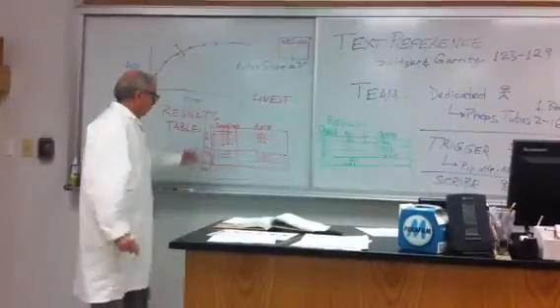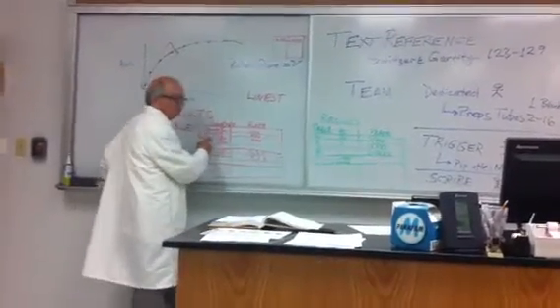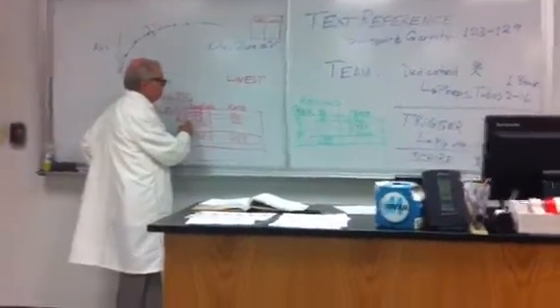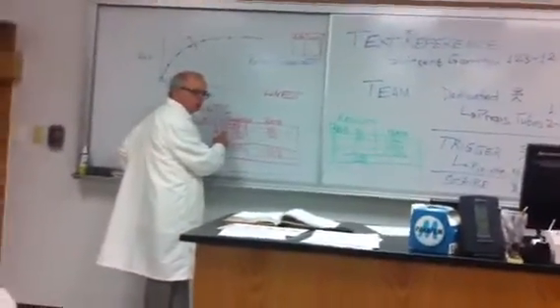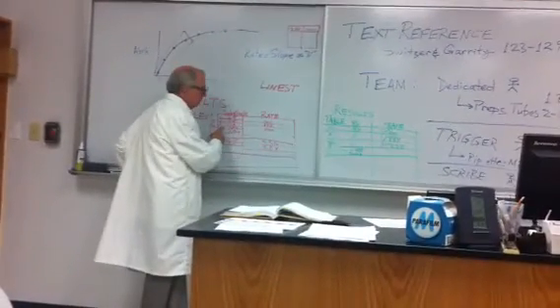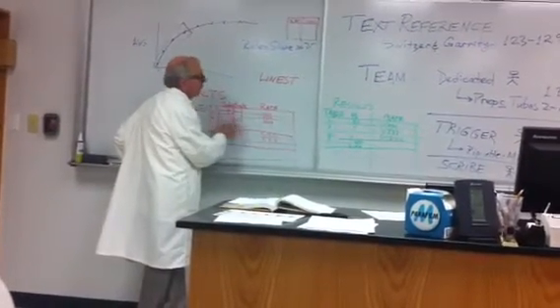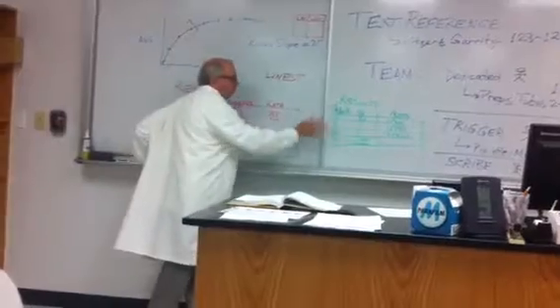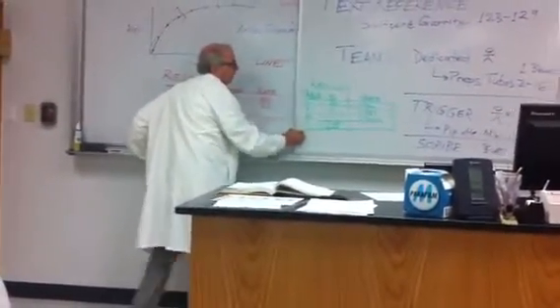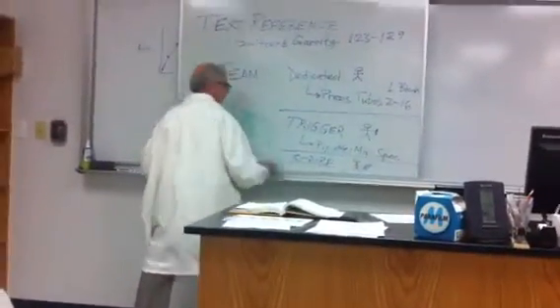And again, I warn you, I repeat, I urge you, if this tube was out of order and it jumped out of sequence, in other words, too high a number or too low a number, for whatever reason, it could be thermal error, for all you know. Guess what? Pull it out. Absolutely pull it. Put it in the table, yes, but before you graph it, yank it out. Don't put it in the graph. And then the graph will look like this. The graph is these three inverse tables.